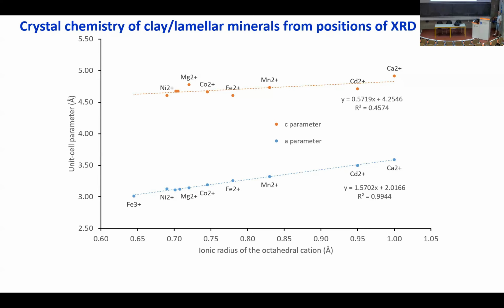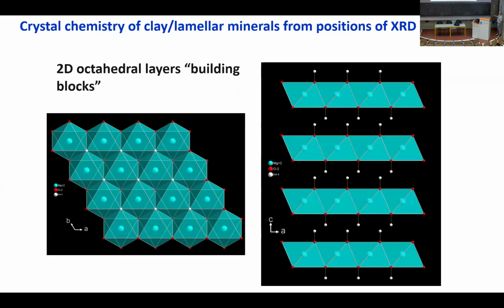Why is that? If you get back to this, the A parameter, the first one, depends on the in-plane distances. And in-plane distances will clearly depend only or mostly on interatomic distances within the sheet.